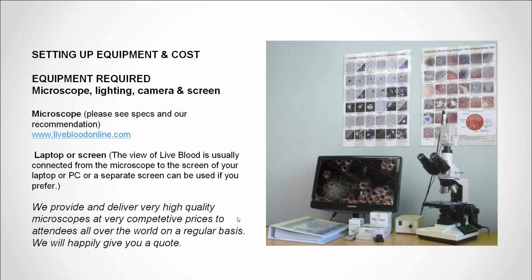So it's very important choosing the right microscope, camera and lighting equipment. So we're going to ask Dr. Oka now for his advice on choosing the right equipment. Hello, Dr. Oka, we have a few questions for you here. Hi, good evening, thanks, Elizabeth. Yes, so are there any shortcuts that can be made when buying a microscope?